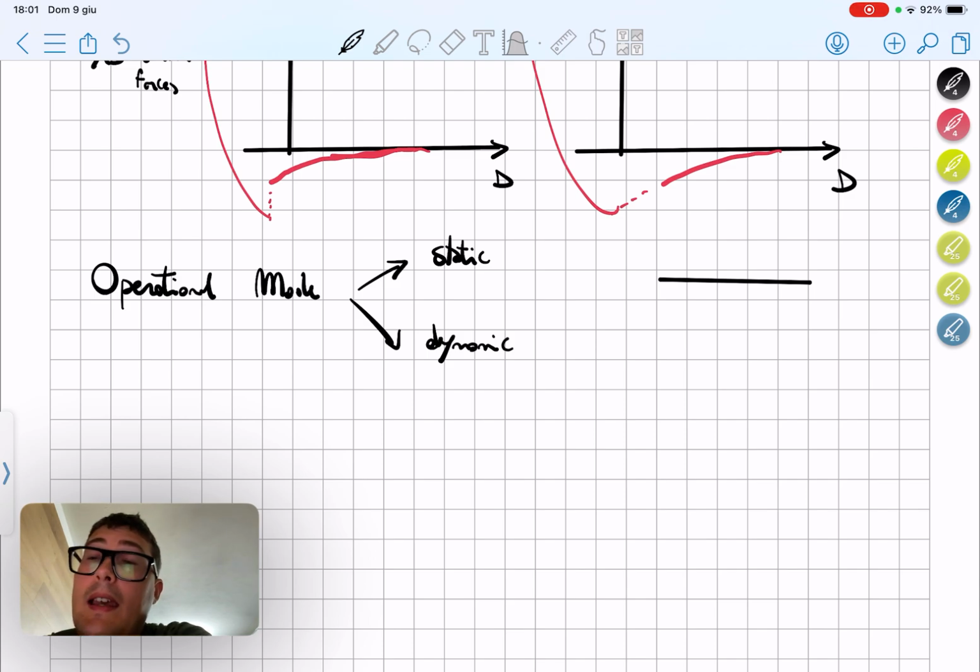Essentially, the principle is that as it reaches a certain point, a certain pixel, we move the tip to the next pixel, and of course the force regime will change, because unless the surface is flat, there will be either a higher peak or a lower peak, and this will cause a further deflection or inflection of the cantilever, and the piezo device will restore the original position, and this restoring is what is actually being used to map the sample topography according to this shifting up and down of the cantilever. Okay, so this is for the static.